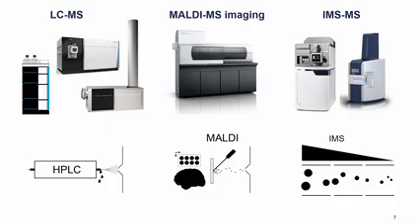Okay, so as you have already heard from the first presentation, ion mobility is yet another way to separate your ions in the gas phase. And with the introduction of this technology and also recently more and more popular imaging technologies like MALDI-MS, we get quite a diversity in the types of data that people use and collect. And all of these need their specific data processing strategy. So if I would summarize the biggest improvement that we have now in MZmine 3, it would be the complex support for all these different types of data.